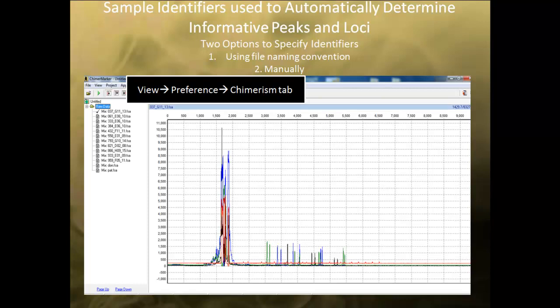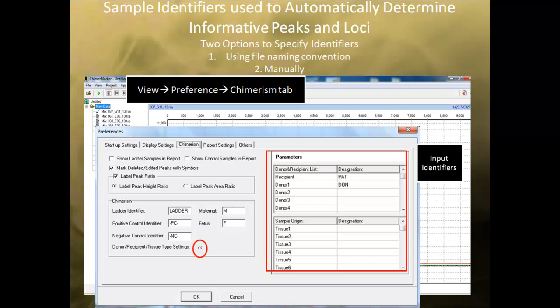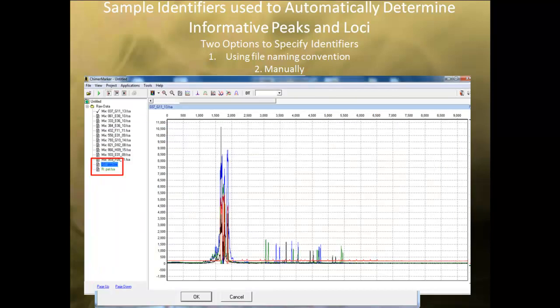ChimerMarker software uses identifiers specified by the analyst to automatically determine which peaks and loci are informative. There are two ways to specify identifiers for donor and recipient samples. The first uses a naming convention. Select View, then Preferences, then go to the ChimerSim tab. Click on the arrows to expand the identifiers, and input the identifiers from your donor and recipient samples so that ChimerMarker knows which samples are single sources. Click OK and the samples will be automatically identified by the software.